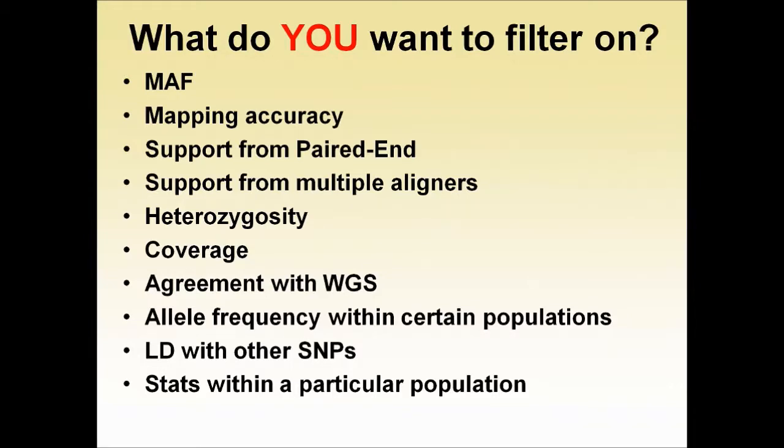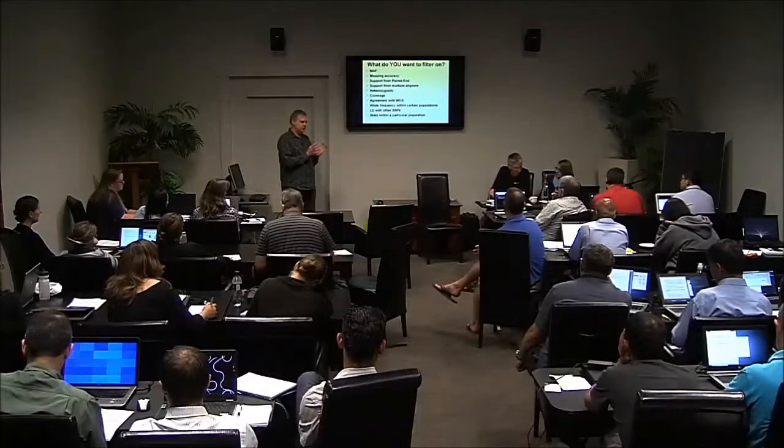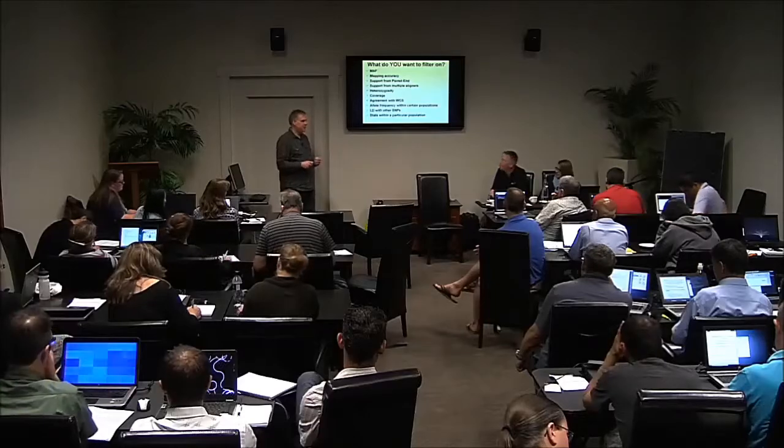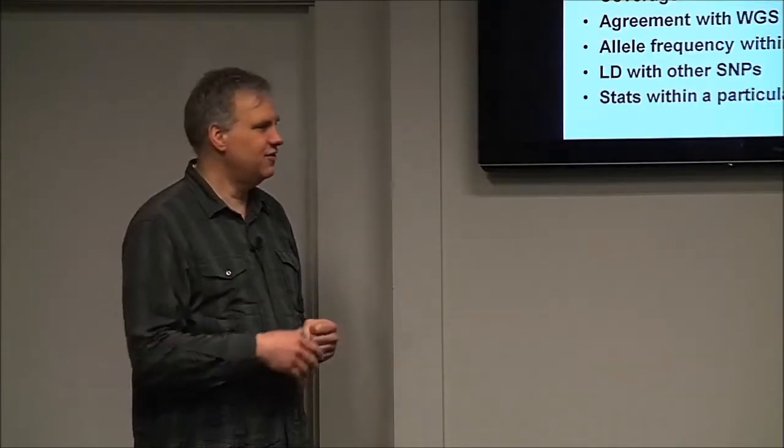So what we're trying to do with TASSEL 5 here is give the user the power to decide how they want to filter the SNPs. So we're basically going to output everything that's a SNP.